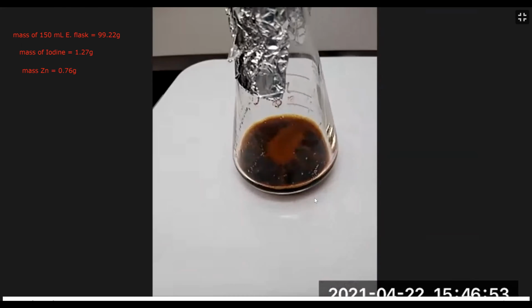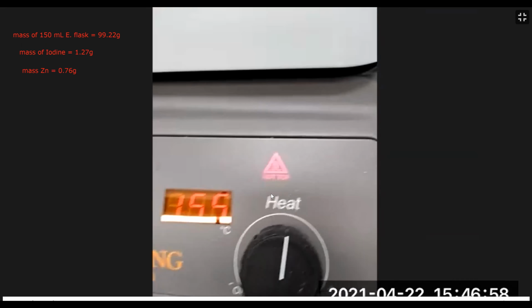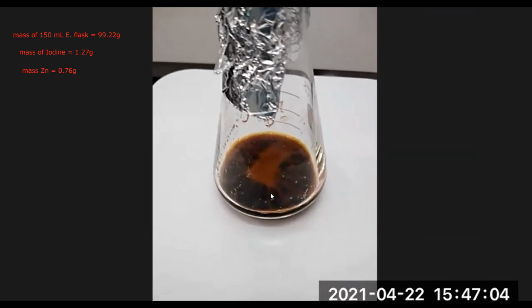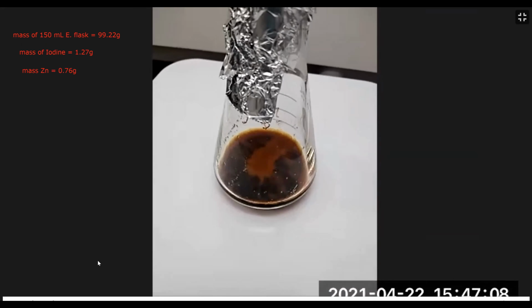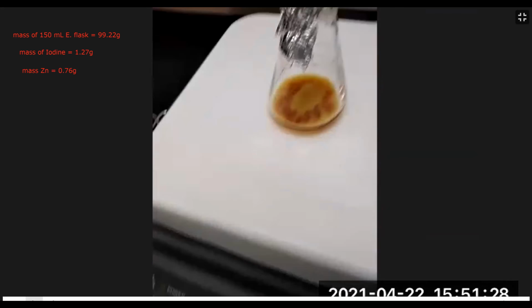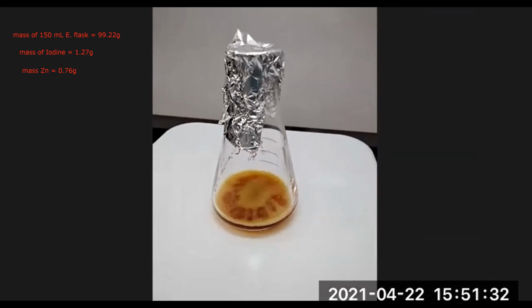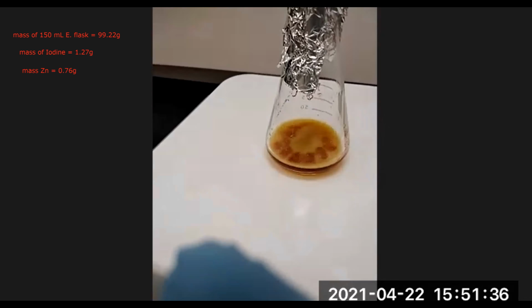And so here you can see it's at a gentle boil, and I have it set to around 155, but again, every hot plate is different. You want something like this where it's at a nice rolling boil as well. So again, this is time elapsed. After some time, I come back, I check it. It's still brown.